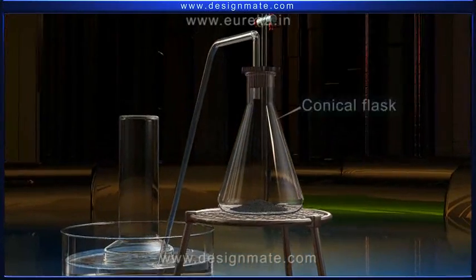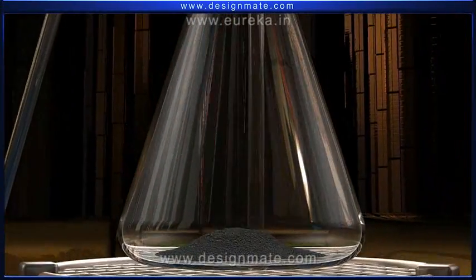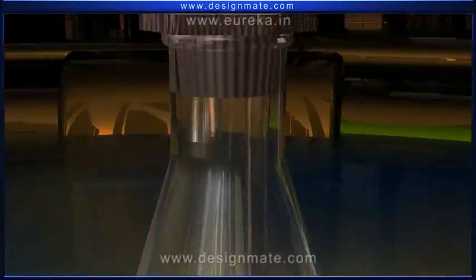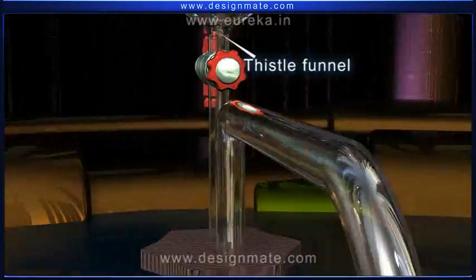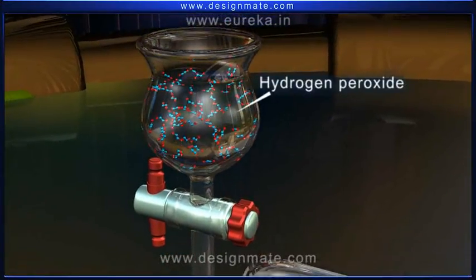The experimental setup has a conical flask containing manganese dioxide, which acts as a catalyst. The thistle funnel is fitted to this flask and filled with hydrogen peroxide.